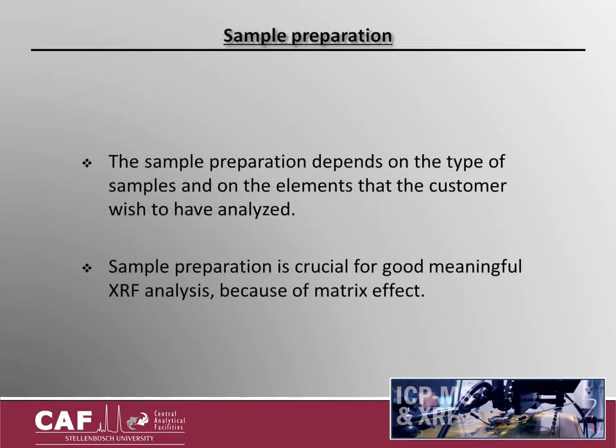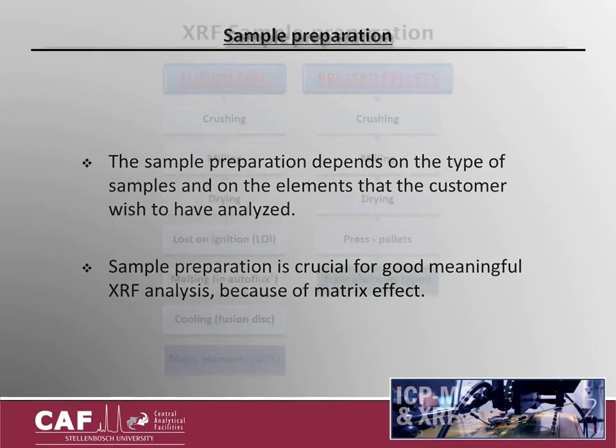The sample preparation, of course, depends on the type of sample and on the elements that the client wishes to be analyzed. Sample preparation is crucial for good, meaningful XRF analysis because of matrix effects. Let's have a look at the sample preparation methods.